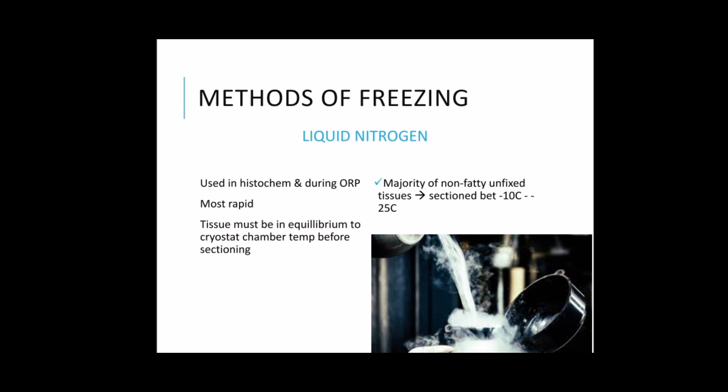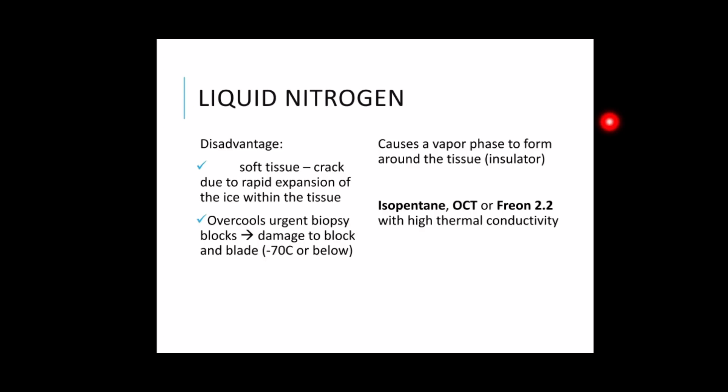Liquid nitrogen also overcools urgent biopsy blocks, causing damage to both block and blade if sectioning is done at negative 70 degrees Celsius or below. Tissue snap frozen in liquid nitrogen must therefore be allowed to equilibrate to cryostat chamber temperature before sectioning is attempted. The majority of non-fatty unfixed tissues are sectioned well at temperatures between negative 10 and negative 25 degrees Celsius. One problem with liquid nitrogen is that it causes a vapor phase to form around the tissue, acting as an insulator that causes uneven cooling, particularly of muscle biopsy, making diagnostic interpretation difficult.